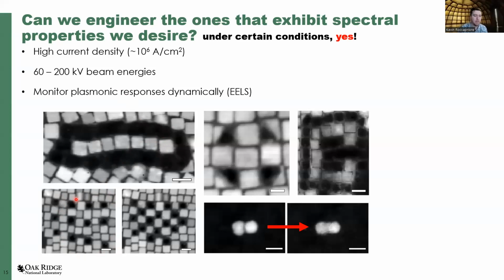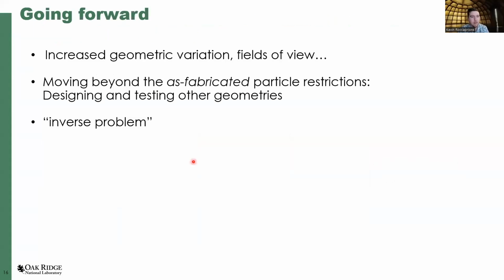So there are a lot of things that you can start to imagine, but particularly here, yes, we can create the shapes that we want right inside the microscope. And of course, there are maybe some non-idealities, like maybe some debris. Where does all the material go? Unclear, but this could be a potential route, is what I'm trying to say. And so then we could use that built structure-property relationship library to guide our inverse design.